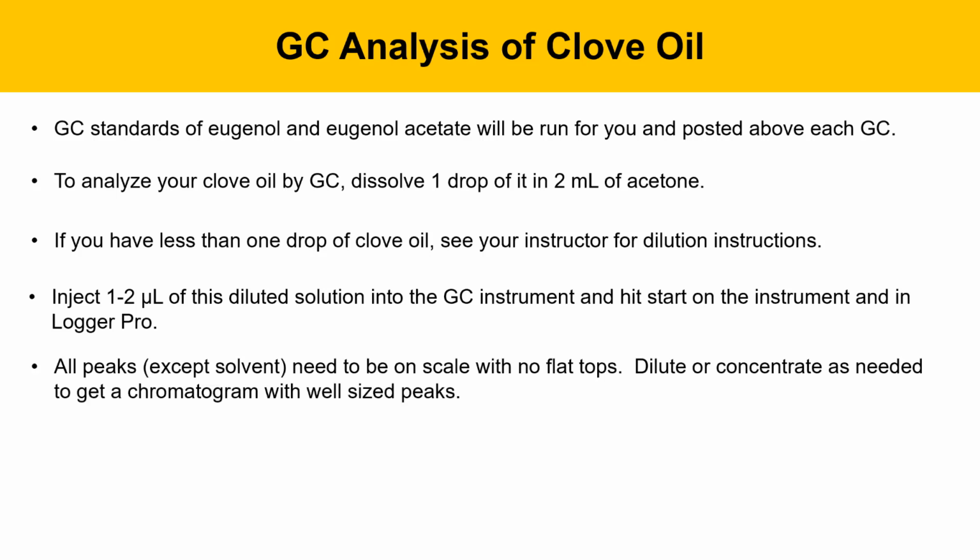All the peaks except solvent need to be on scale and not have flat tops. If you've got peaks that have flat tops, you need to dilute it to make them come on scale, or if you're having difficulty seeing your clove oil peaks, then we'll need to concentrate the sample and rerun it. We need to have well-sized peaks so we can integrate them properly.